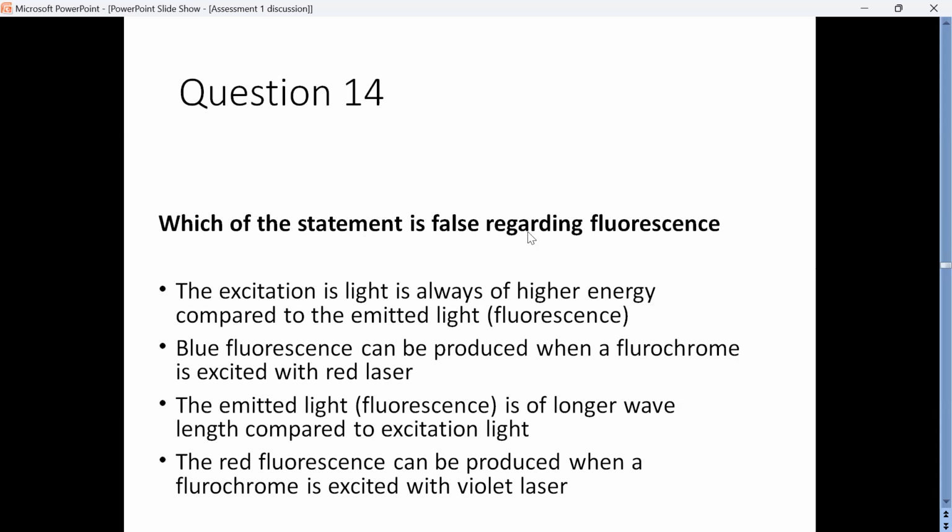Okay. So, which of the statements is false regarding fluorescence? Before we go into this question, let's just revise fluorescence. Please enumerate the low resolution assays again. Low resolution assays: one is ploidy analysis, the other is RBC analysis, where there is no separation from the negative or a very tight separation between the different populations. Those are all low resolution assays.